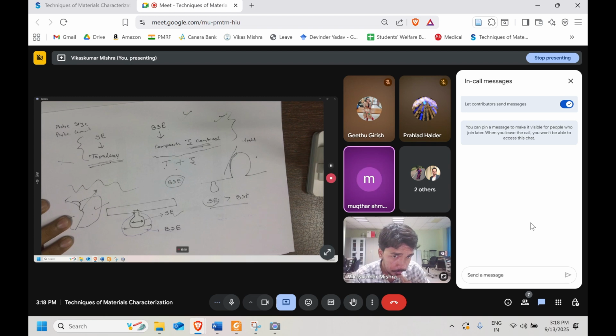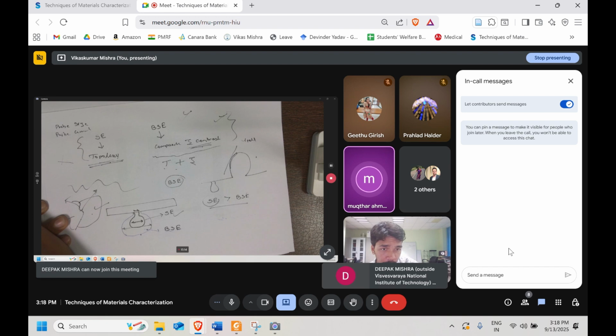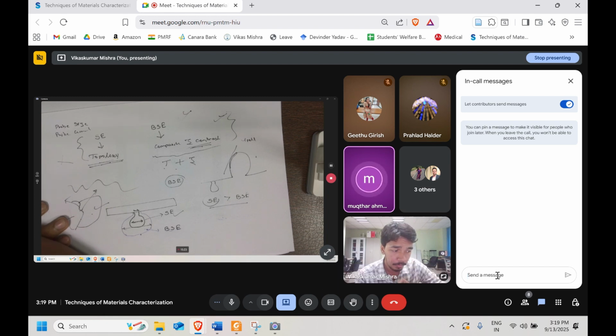If you're focusing on resolution, you need to compromise on contrast, or if you want good contrast, you need to compromise on resolution. But here, the three factors are supporting to get either resolution or contrast. So I need to first decide whether I need the best resolution or the best contrast. Based on that, I need to fine-tune the probe size, probe current, and the pixel size.